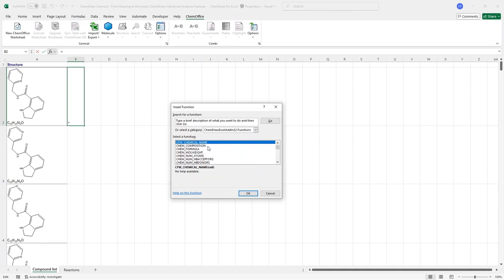And again, that's the third place where you can, by using these functions, predict certain properties, generate additional information, so enrich your list of structures with simple information like the name or the SMILES code, the composition or the formula, but you can also go beyond that and predict certain properties like boiling point, log P again, and so on and so on.